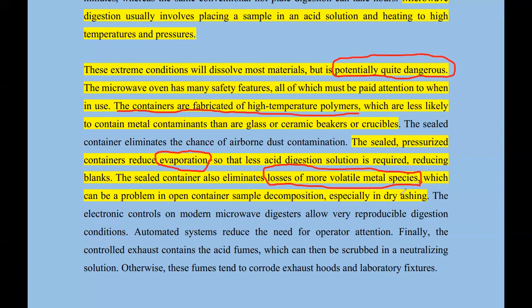You see, I've spoken of dry ashing and wet ashing. So in dry ashing, you don't use an acid. You're just getting the sample and then exposing it to high temperature. Now, because there is just high temperature, there isn't much overboiling. As a result, you find that they do not seal the container. The container may be left open. It's just a decomposition. And in dry ashing, you find that a lot of sample may be lost as the process of decomposition is going on.